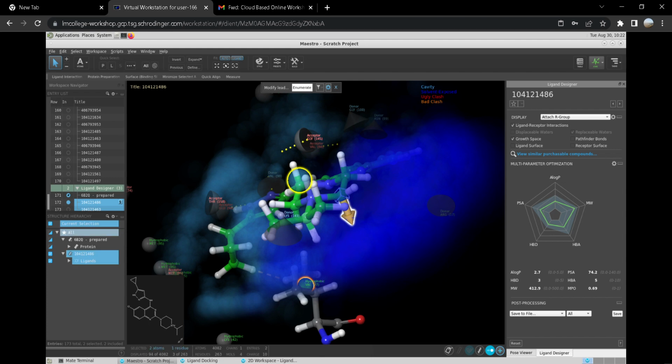Yeah, thank you, Kaushik, for helping us with that. So I think we shall wait for another 10 to 15 minutes so all of you can explore the ligand designer. It's an excellent tool, and let us know how you felt about it. So I shall wait for another 10 minutes so all of you can check and get back.